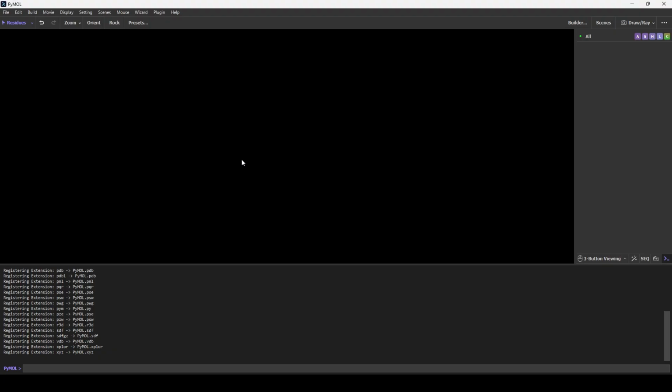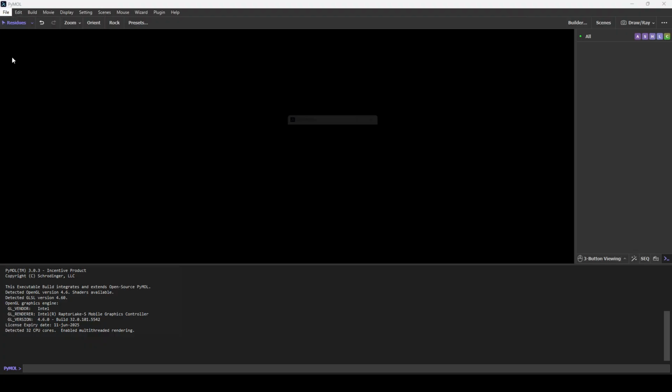The first portion of the visualization is to import your model. This is done through a PDB file. The PDB file contains the data of the biomolecule structure, which was obtained by methods such as X-ray crystallography or NMR. There are several ways to import a PDB file, and I will demonstrate four. The first method is to fetch the PDB file from the RCSB website. RCSB stands for the Research Collaboratory for Structural Bioinformatics Protein Data Bank and is the US branch of the Worldwide Protein Data Bank. To fetch the file, we will navigate to File, Get PDB.